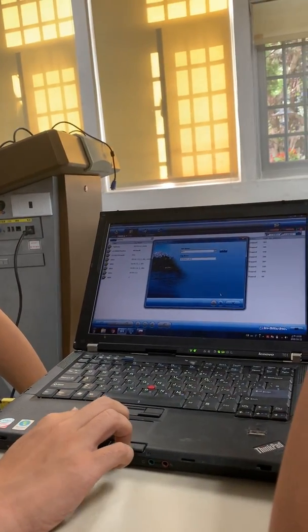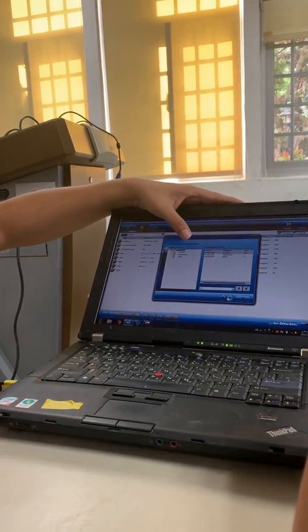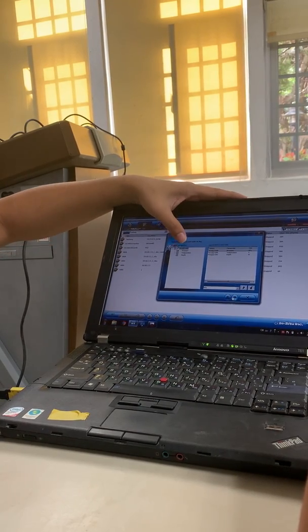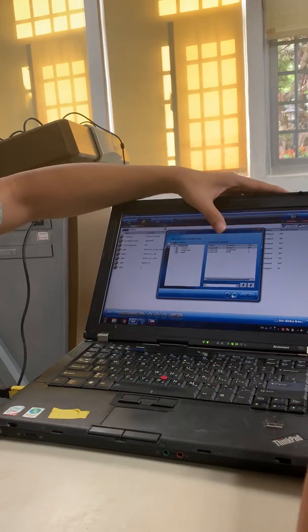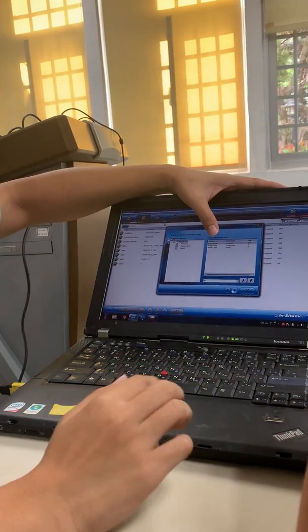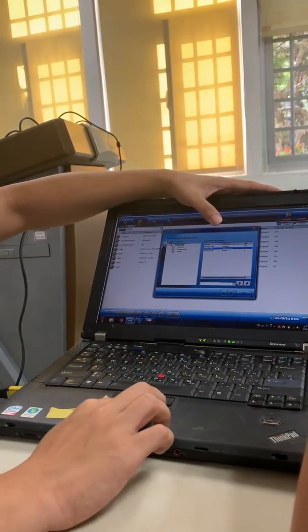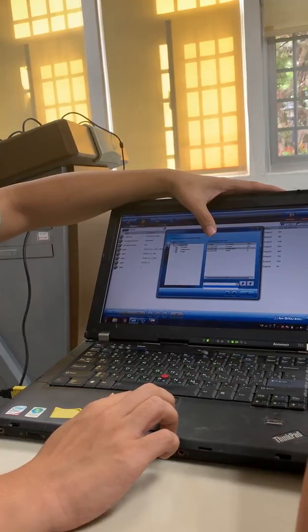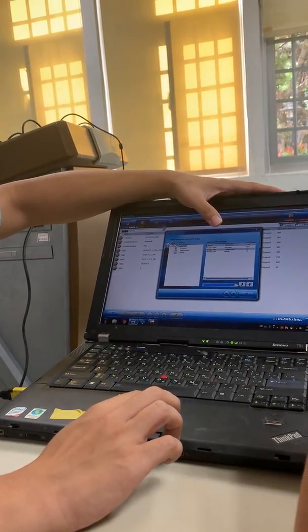The Level 2 device measures depth and temperature only. There is a unit field here — if you want to change the units, just click here and change them. Any other questions? Let's move to the next step.